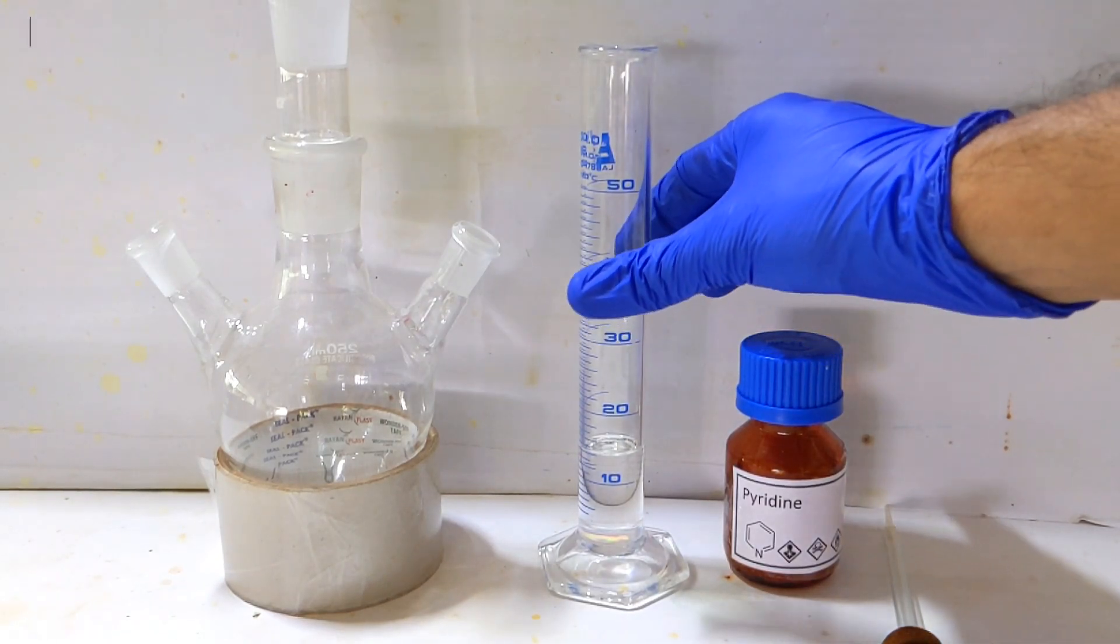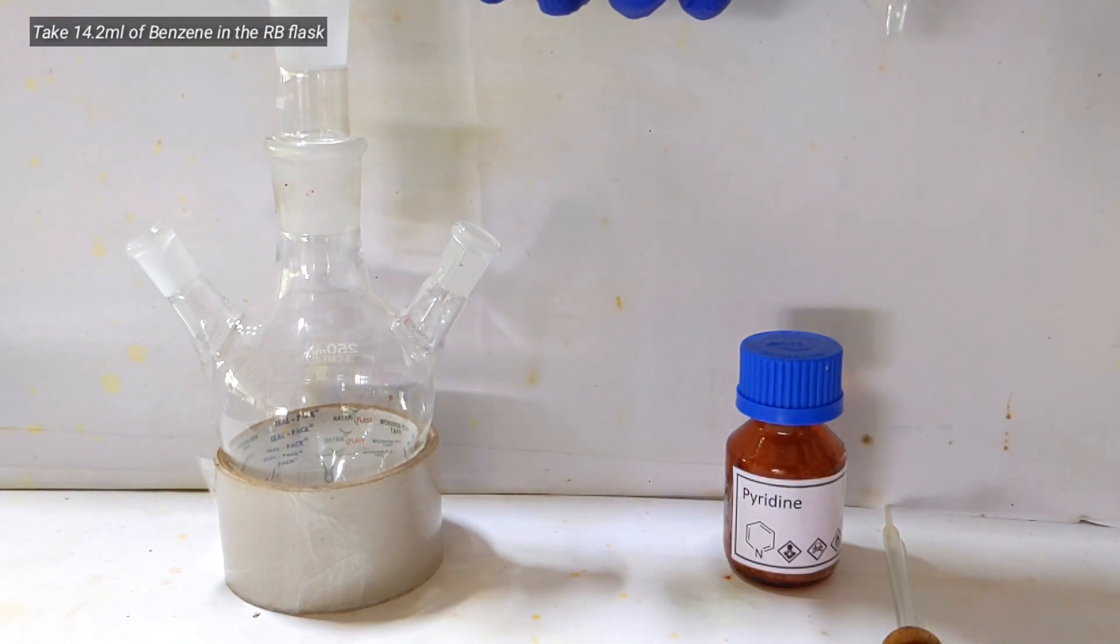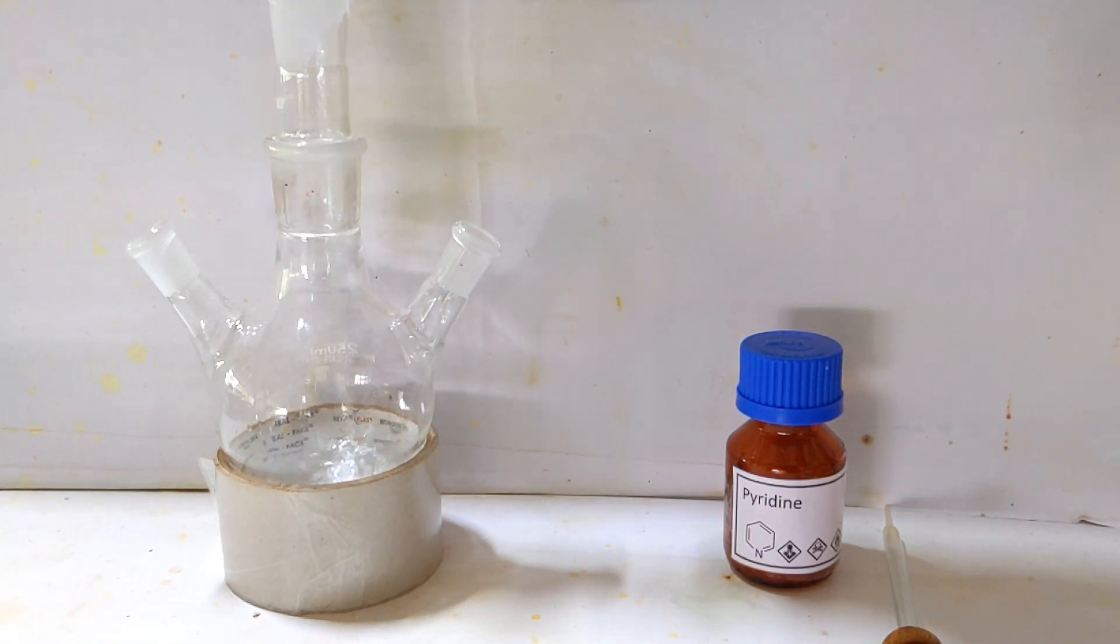Start by taking a 250 ml round bottom flask and pour 14.2 ml of benzene into it. I am using a 3-neck round bottom flask for convenience in the next step where I add the bromine.